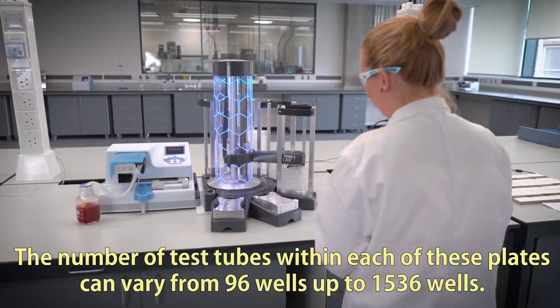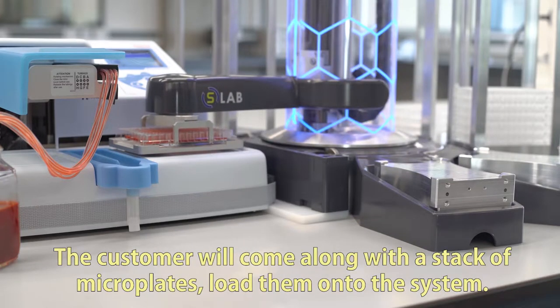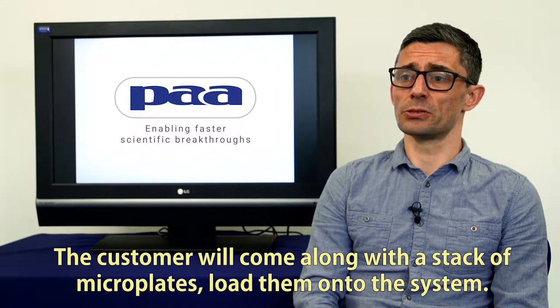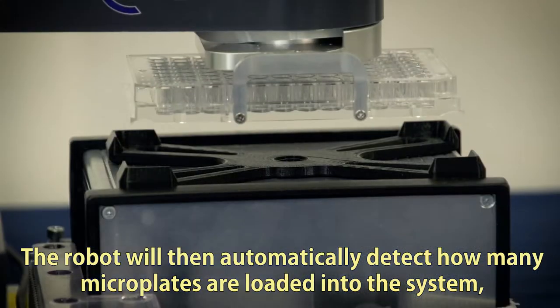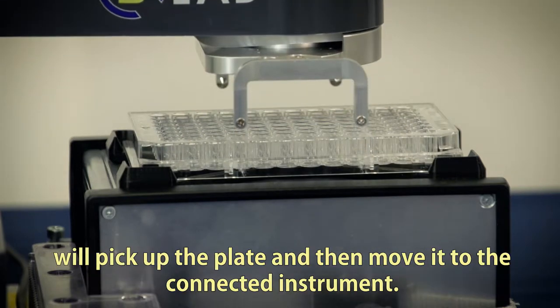The number of test tubes within each of these plates can vary from 96 wells up to 1536 wells. The customer will come along with a stack of microplates and load them onto the system. The robot will then automatically detect how many microplates are loaded into the system, pick up the plate, and move it to the connected instrument.